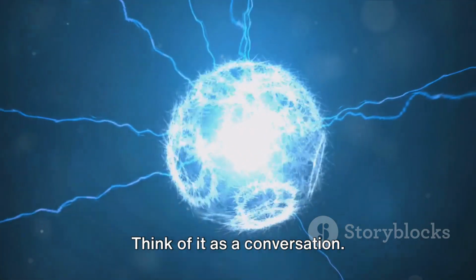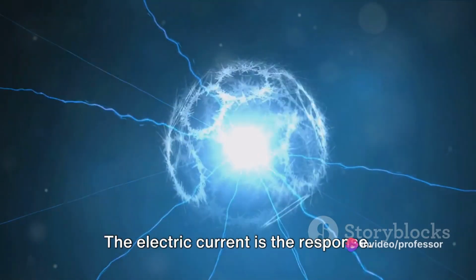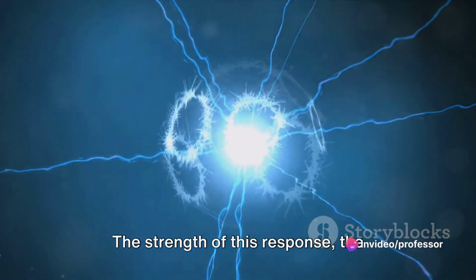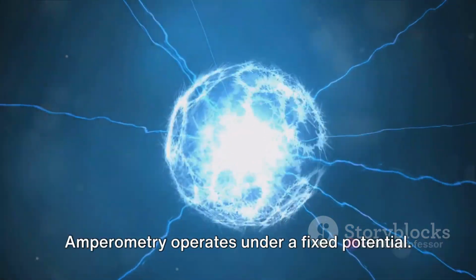Think of it as a conversation. The voltage is like a question posed to the substance in the solution. The electric current is the response. The strength of this response, the intensity of the electric current, is then measured and recorded.